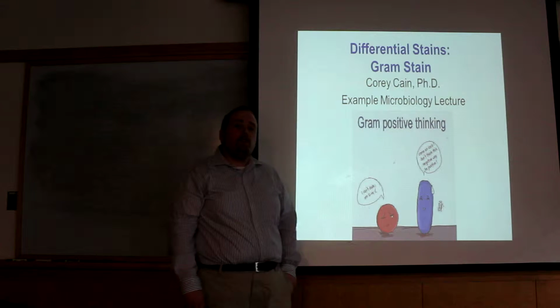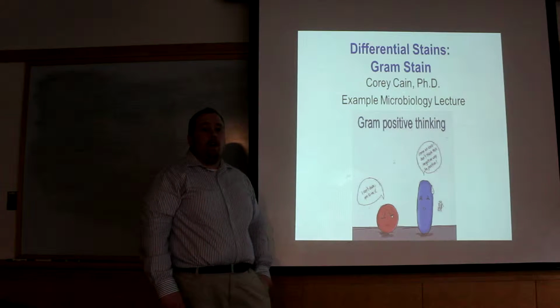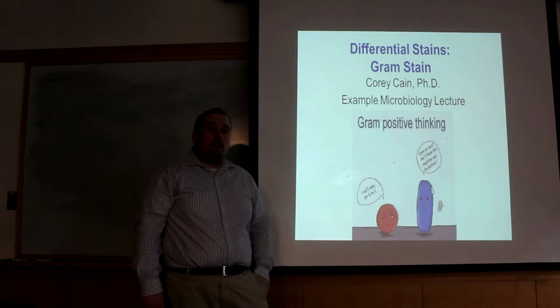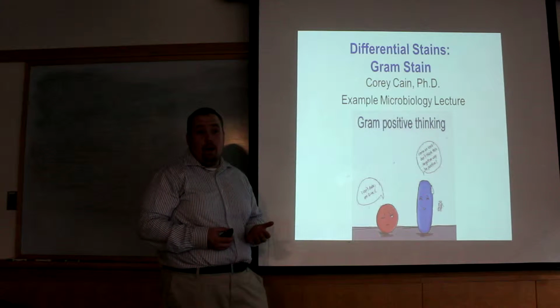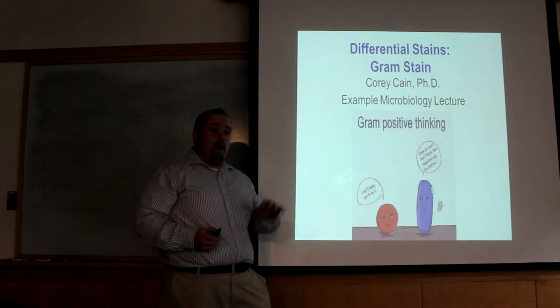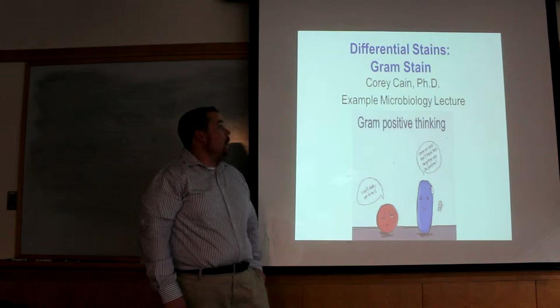I'm currently a postdoctoral scholar at UCSF, and today I will be giving a lecture on microbial stains with a focus on the Gram stain. Gram stain is a very important stain in microbiology. The students are going to be required to obviously know how to do this technique, and it's very important in identifying student unknowns in later parts of the microbiology courses that I've taught as well.